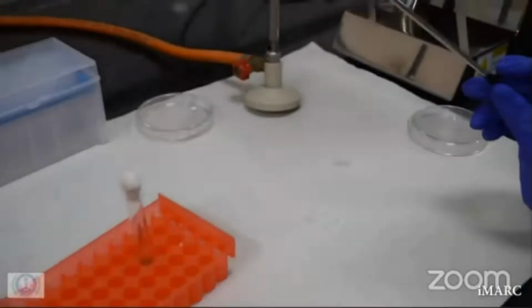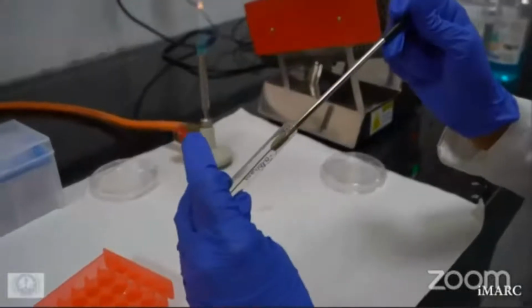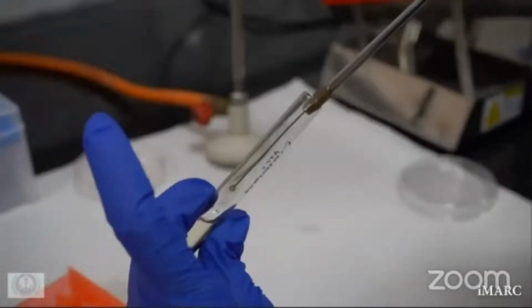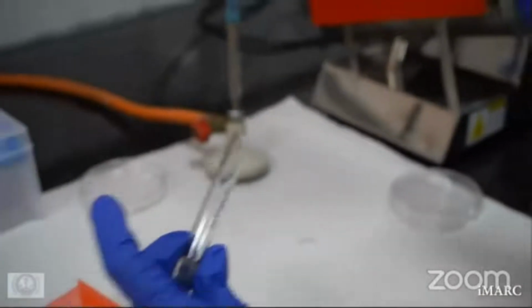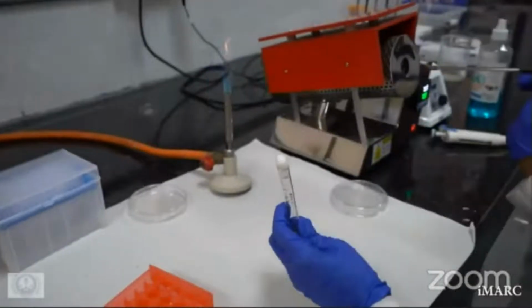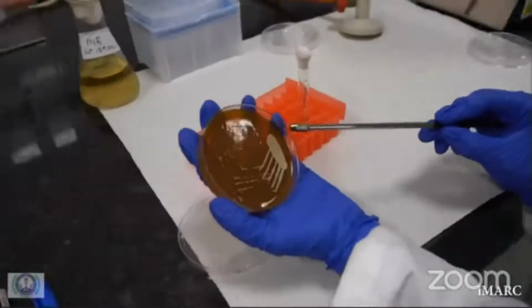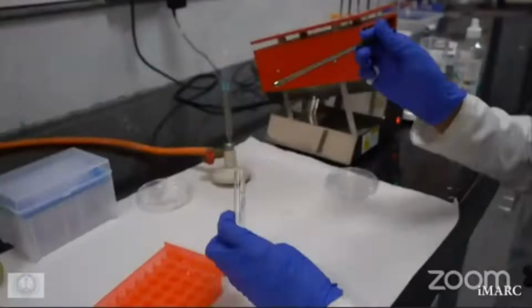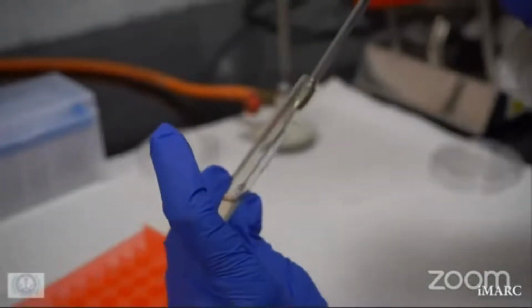the agar surface hardens. After the agar surface hardens, place a carbohydrate impregnated disc on the agar plate. The preparation of the disc can be done in-house or obtained commercially. If done in-house, sterile discs are used and 10% filter sterilized sugar solutions are added to them. After drying the discs, they are stored at 4 degrees Celsius. The plates are incubated at 37 degrees Celsius for 3 to 4 days.